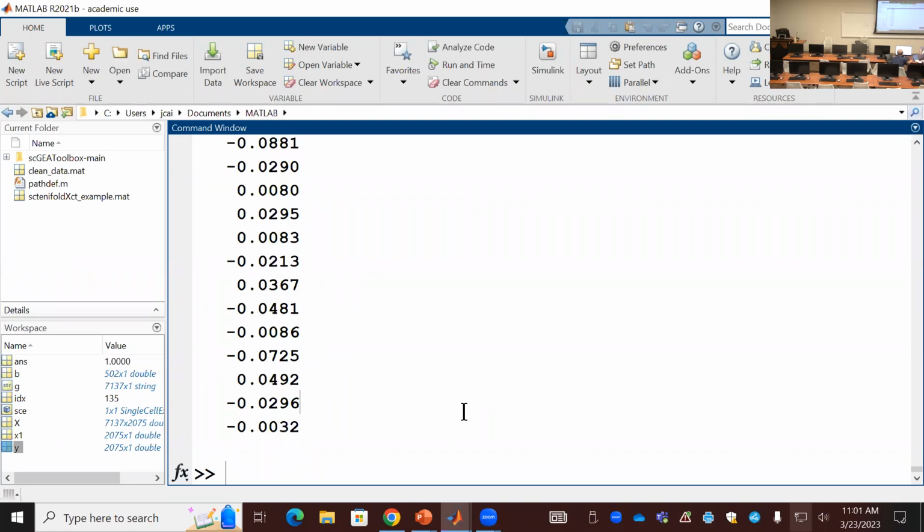The percentage of expression, non-zeros. That's average. So if you have two groups, then you have only two columns, but you have a lot of genes. I think this is better than violin plot.